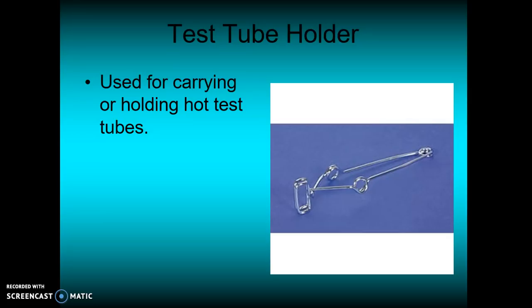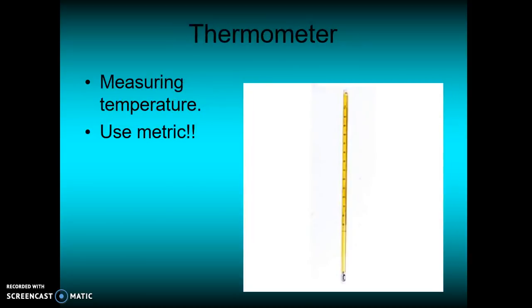Test tube holder, we have already discussed that. These are used for carrying or holding hot test tubes. When you're heating any test tube, you don't have to hold it in hand and heat it. So these are used for carrying the test tube and heating the test tube.